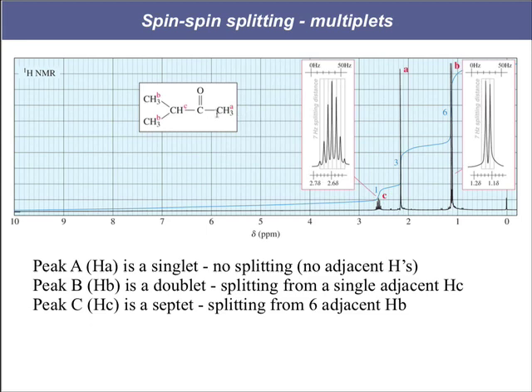A comes next. It's our singlet next to none. So that's there at 2.1. And then lastly, our B's are the most upfield, next to 1, meaning splitting into a doublet. And we've got the integrations: 6 for the B's, 3 for the A's, and 1 for the C's.